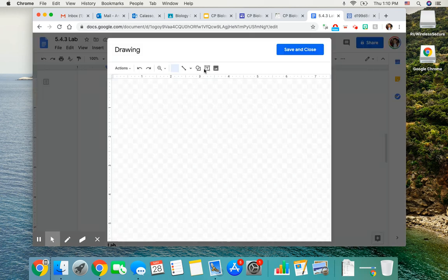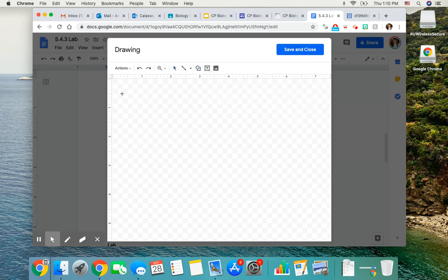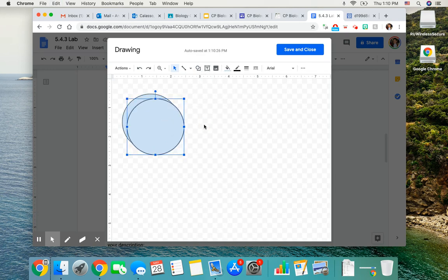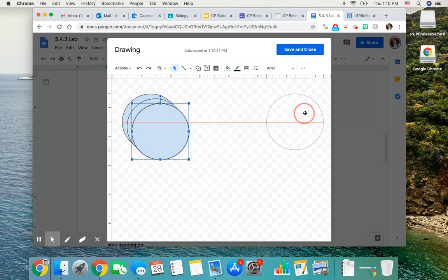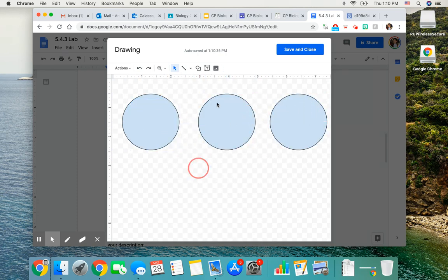And you can make 2 petri dishes, or you can make 3 actually, because we want to have, so you could have like 1. Okay, so I'm just going to copy and paste that over, make it easier for myself, right? So we have 1, 2, 3. Okay, and then all you want to do is label them. So you could have like control group.